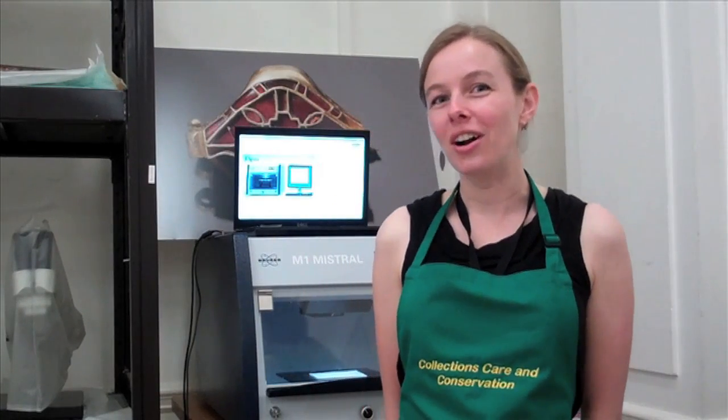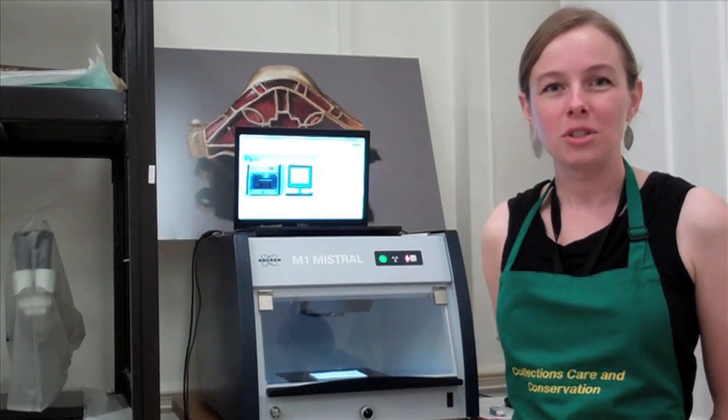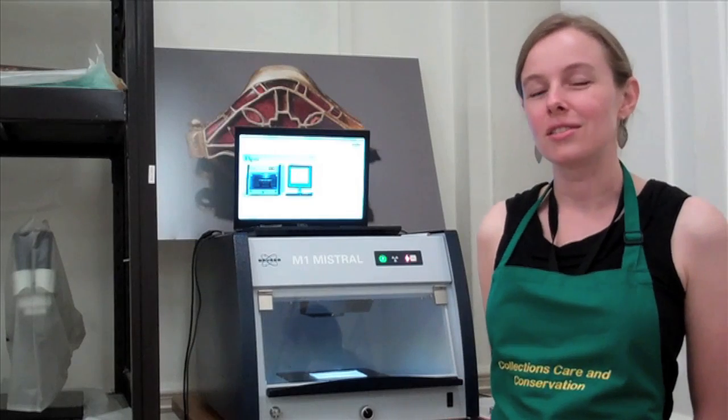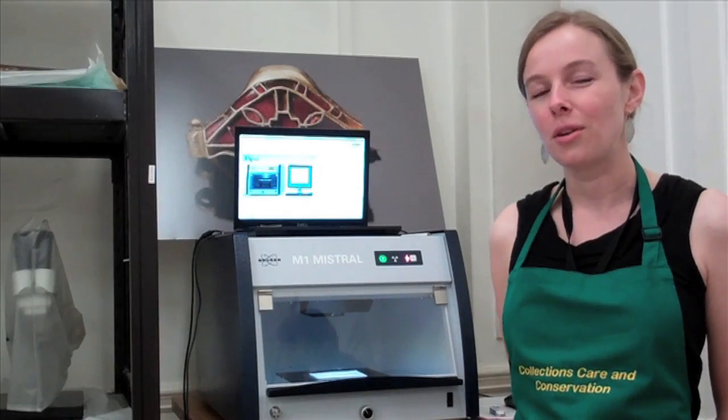Today I'm going to talk about our lovely Bruker M1 Maestral XRF machine, that's X-ray fluorescence machine, and I'll talk to you a little bit about the theory behind XRF.